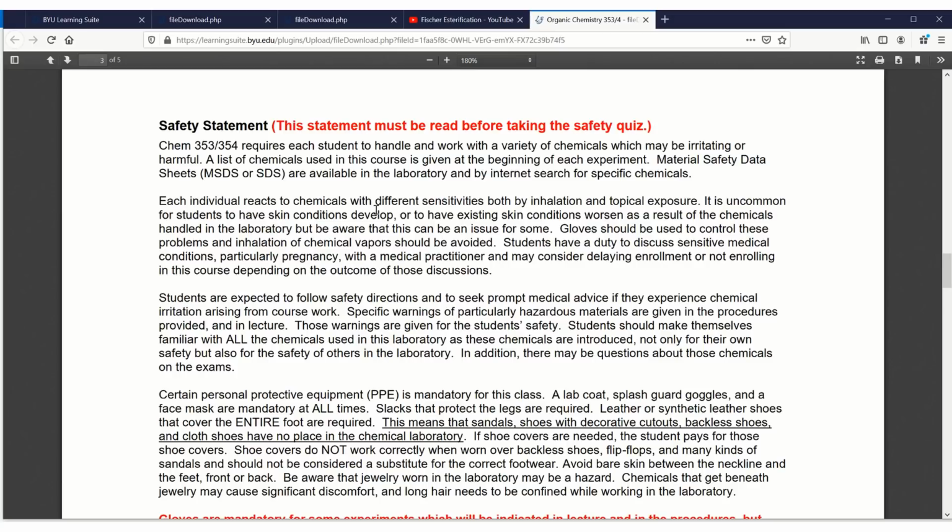They may be more easily searched online just by simply searching a chemical name and MSDS or SDS afterwards. These sheets are prepared by manufacturers. A lot of the information is very rudimentary, and so we get the same type of information from chemical to chemical. You probably want to pay particular attention to parts of an SDS or MSDS sheet that refer to toxicity. Those values are actually determined in a laboratory and are potentially more reliable than the opinions of a manufacturer.